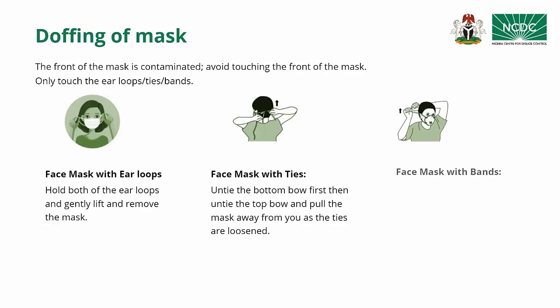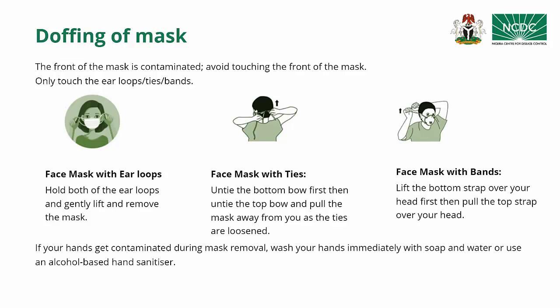And to doff a face mask with bands, lift the bottom strap over your head first, then pull the top strap over your head. Again, if your hands get contaminated during mask removal, wash your hands immediately with soap and water or use an alcohol-based hand sanitizer.